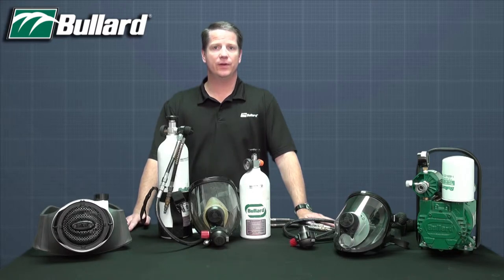First of all, the Spectrum can be configured into one of four respirator categories, depending upon the need and the application.